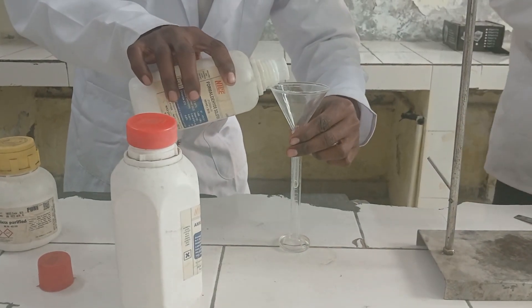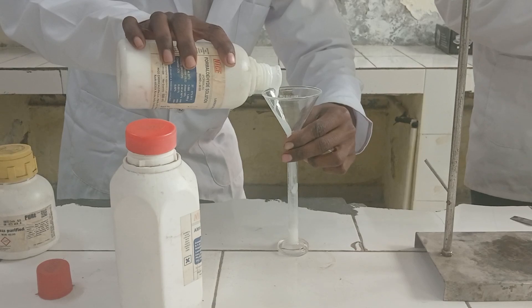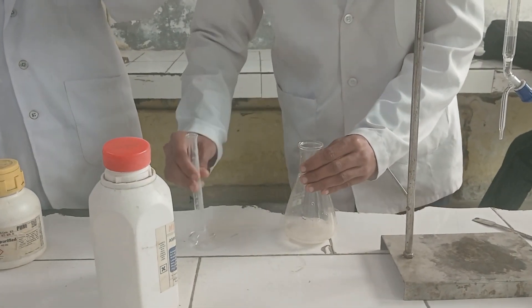Now, we are adding 5 ml of formaldehyde solution to the conical flask.